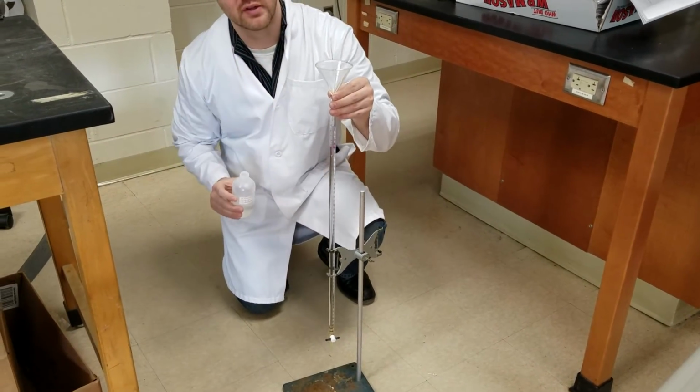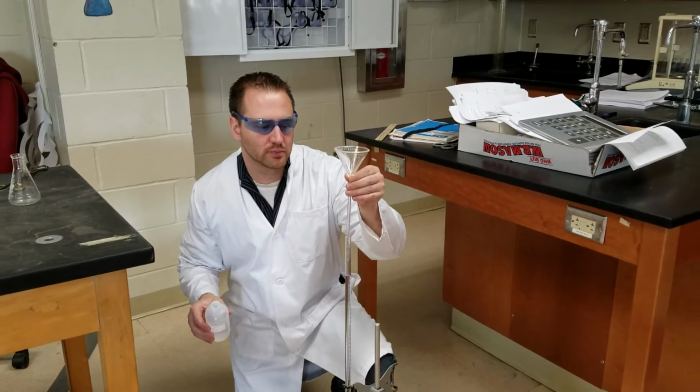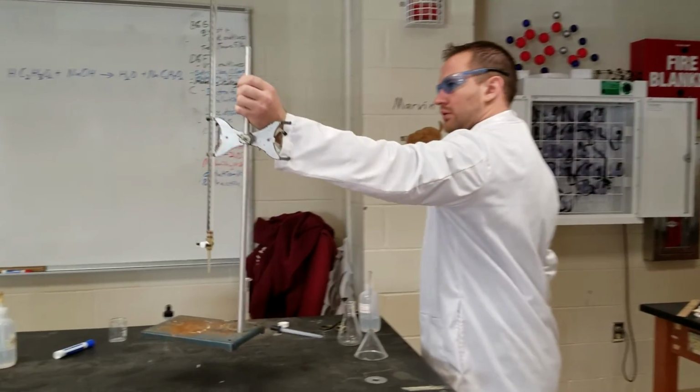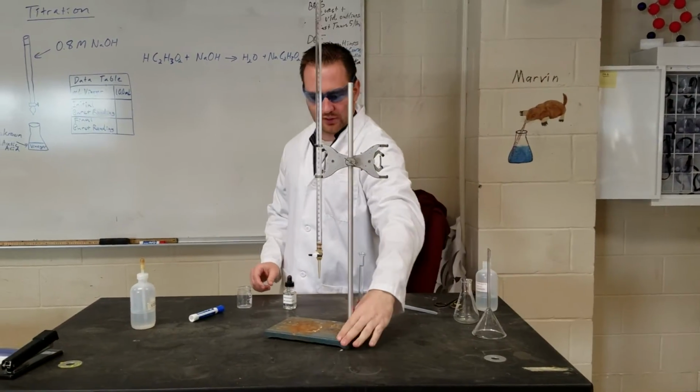And you don't have to fill it exactly to the 0 mark, because what we're looking for is the change in volume, because that's going to be how much volume of sodium hydroxide will be dispensed. So at this point, I'm going to place the sodium hydroxide solution and burette up here.